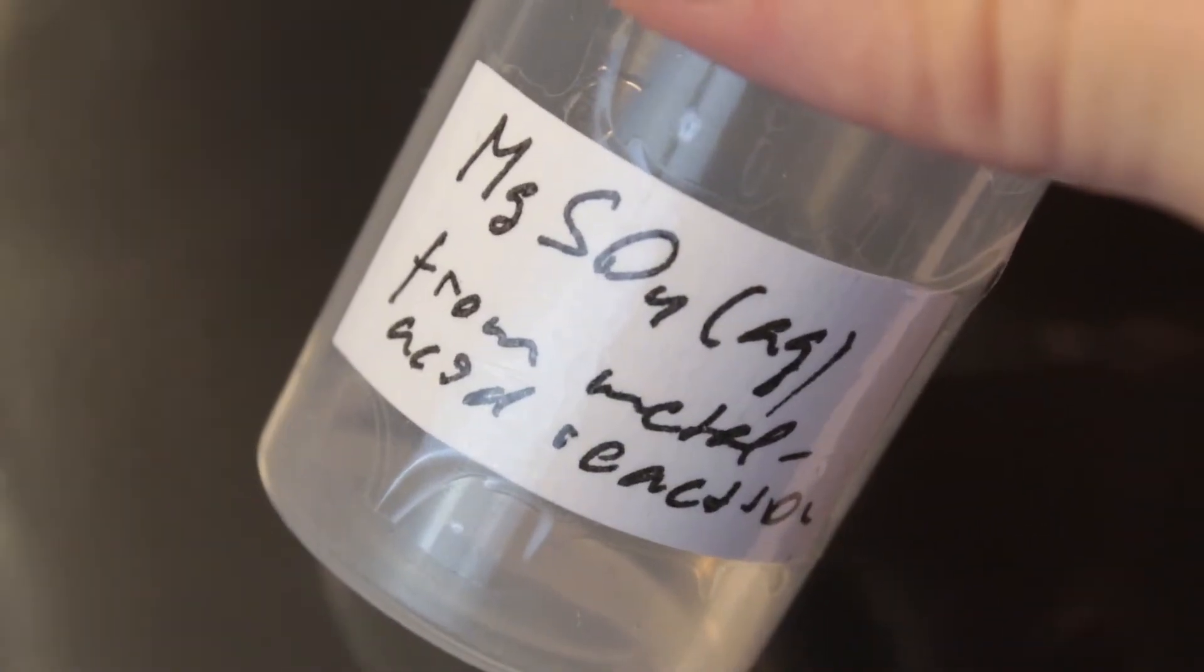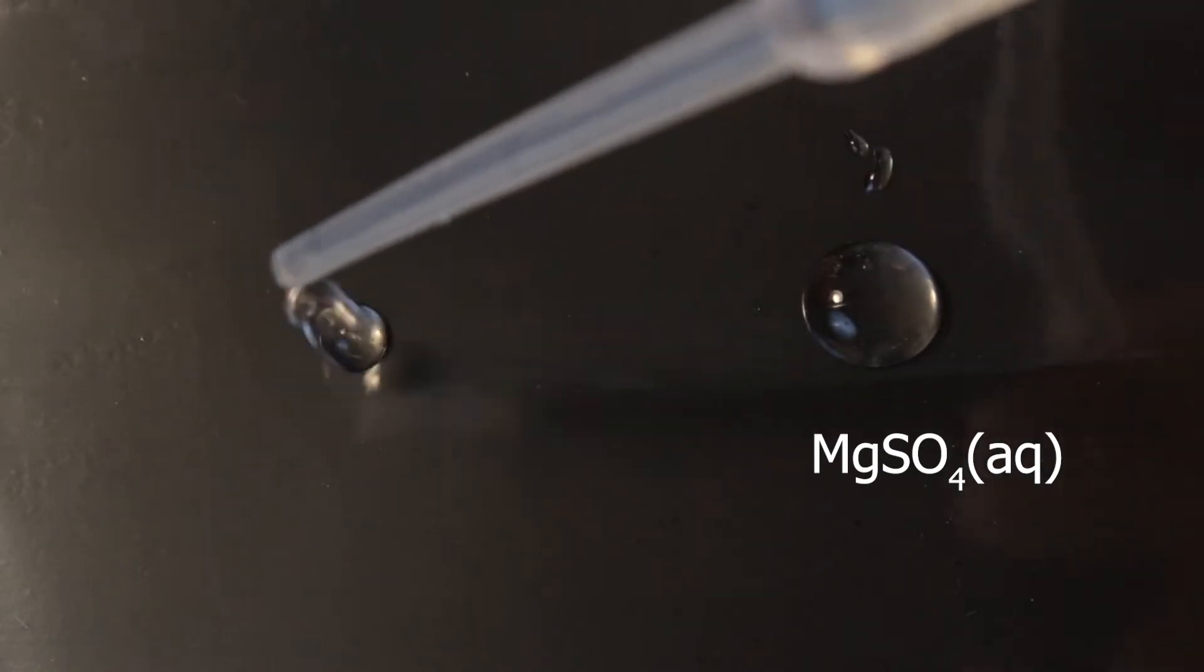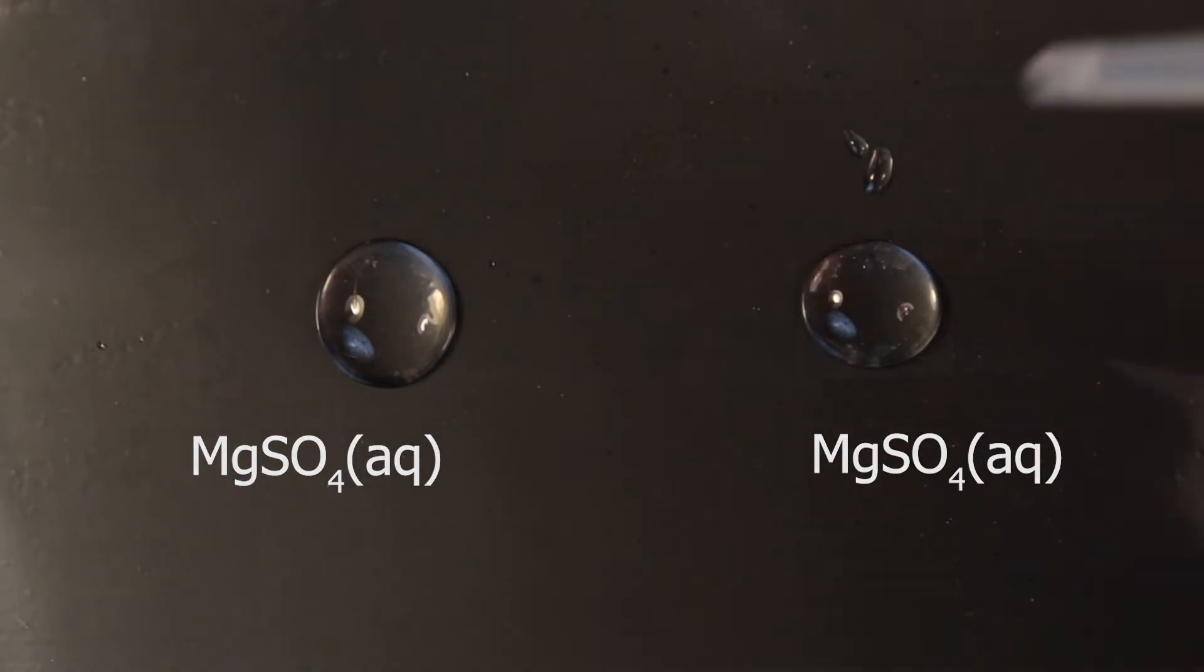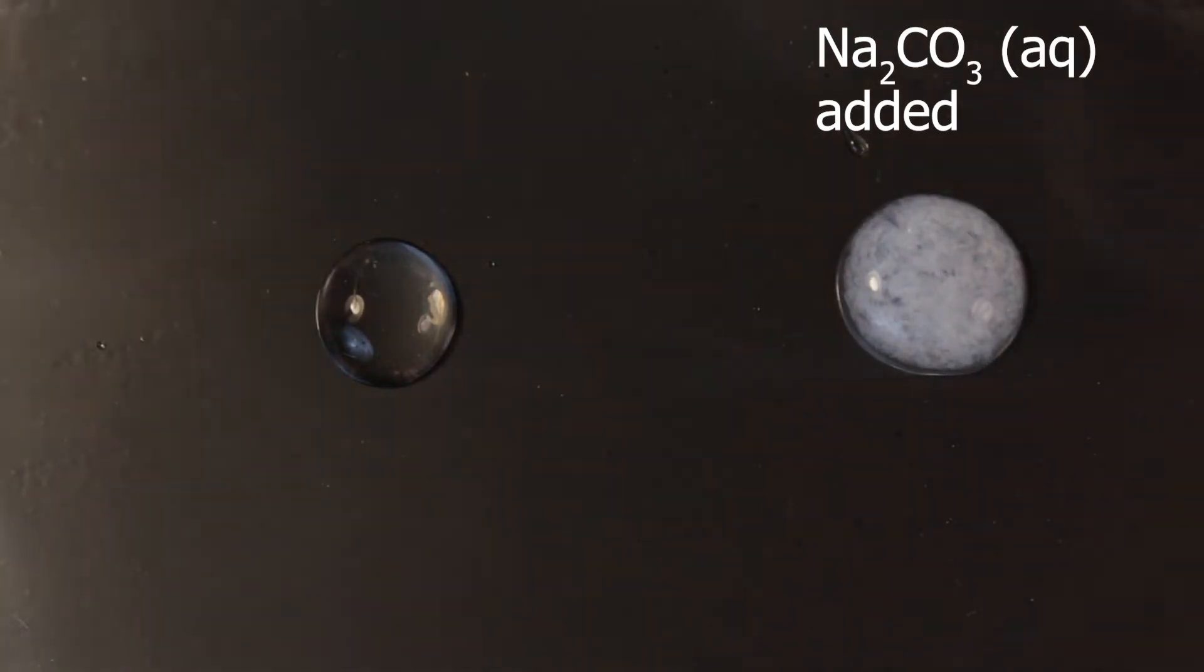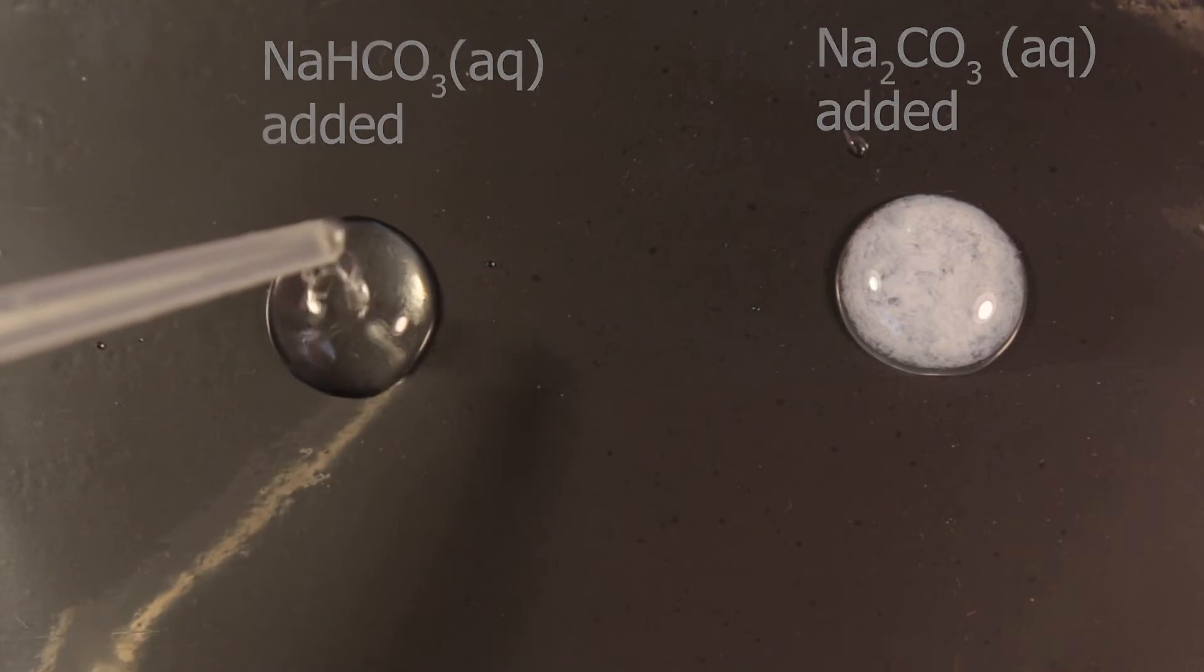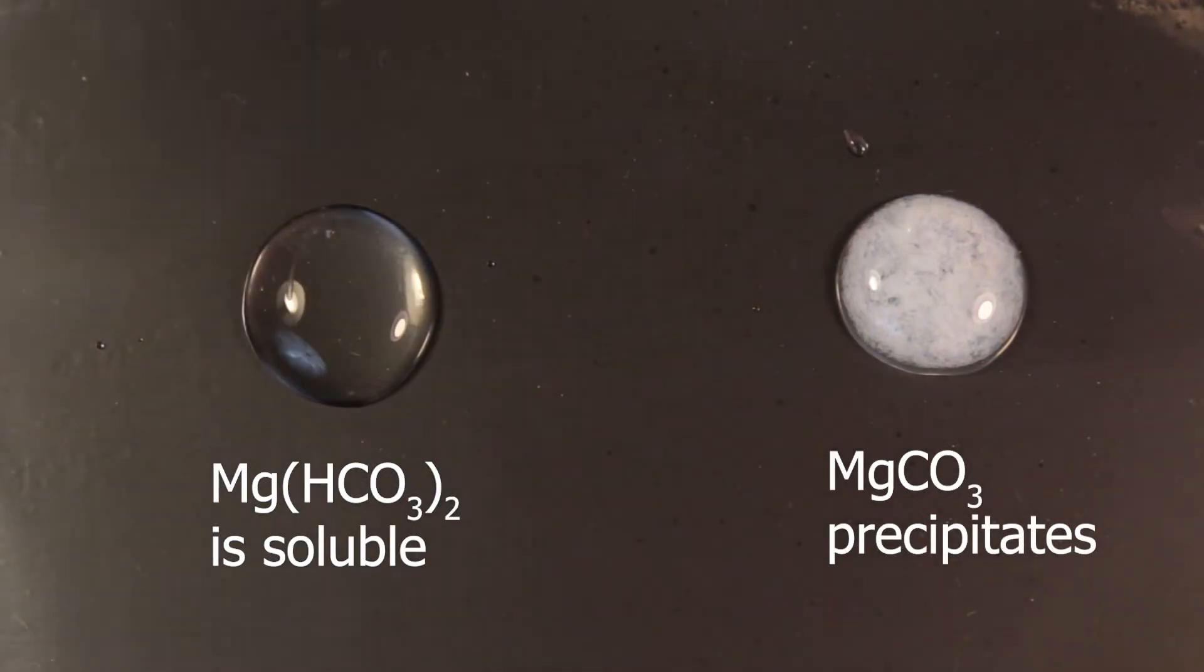Now let's check solubility. We use magnesium sulfate salt as an example, and let's add carbonates and hydrogen carbonates to it. Hydrogen carbonates are soluble. Carbonates, though, are insoluble.